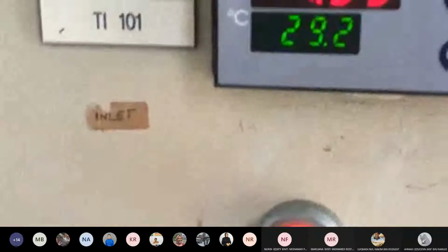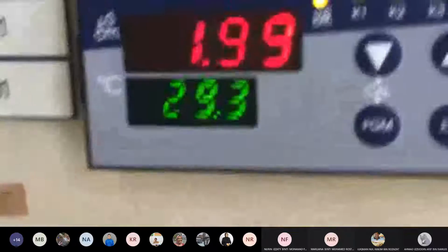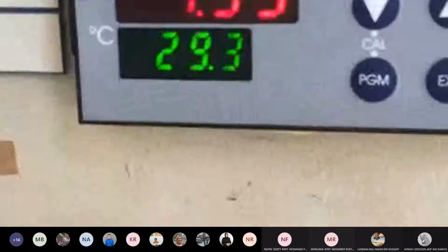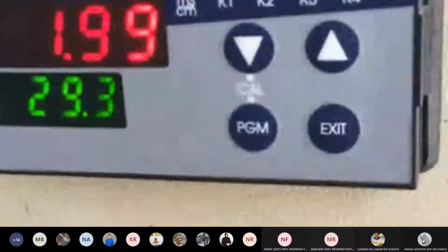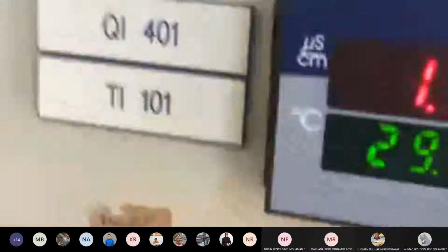So, theoretically, kalau kamu perasan, conductivity inlet takkan berubah banyak sebab tindak balas belum berlaku. So, contohnya, if you prepare your reactant accurately, concentration dia 0.05, bacaan dia sepatutnya 10. Okay, so 10 ni takkan berubah tau. Dia fluctuate sikit lah, maybe 10, 9, something like that. But it won't fluctuate much. Or it will not decrease or increase.